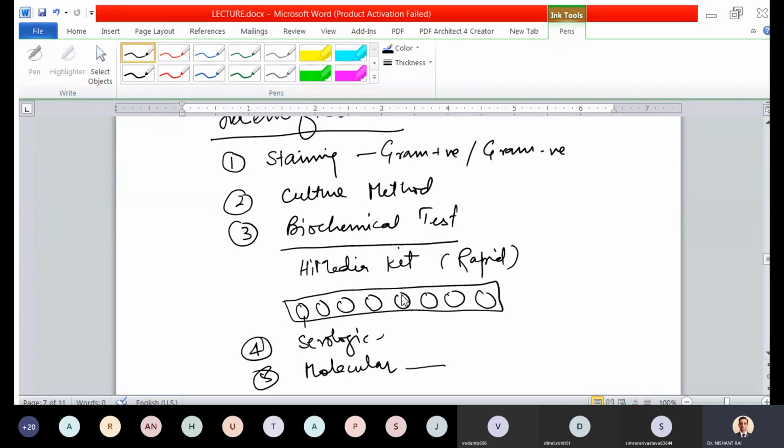But if it is asked that a sample is given to you containing bacteria, count the bacteria, then you will follow different methods. बैक्टीरिया को काउंट करने के मेथड अलग होंगे, जिसमें स्लाइड मेथड होगा या अलग तरह के मेथड होंगे, डायरेक्ट मेथड या इनडायरेक्ट मेथड होंगे. बट यहाँ पर हम कॉलोनीज काउंट कर रहे हैं, राइट? एंड बेसिकली इट इज ए इनडायरेक्ट मेथड ऑफ enumerating bacterial population in terms of growth.